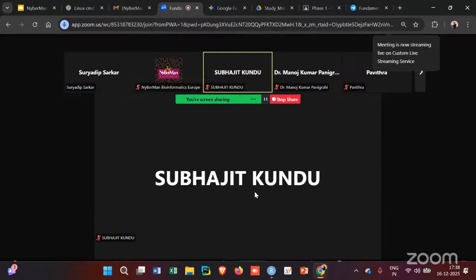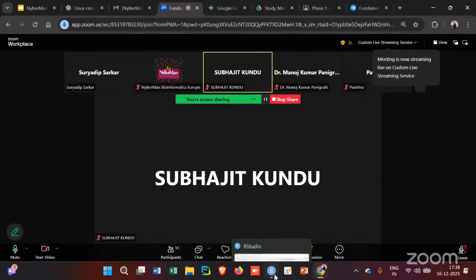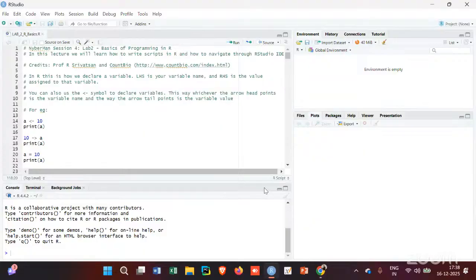Again, this is going to be a hands-on coding kind of lecture. I will tell you first and foremost that I don't expect you to become experts in R coding in just one day. Coding is something that you get used to and get good at with practice. So don't worry if you don't understand how everything is working on day one. Even I did not understand during my first day. It took time and a lot of practice.